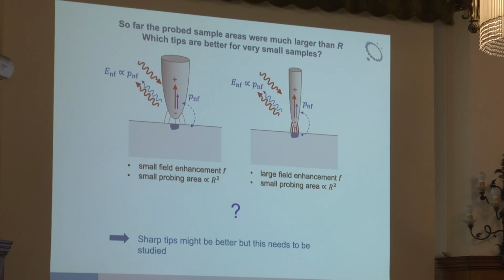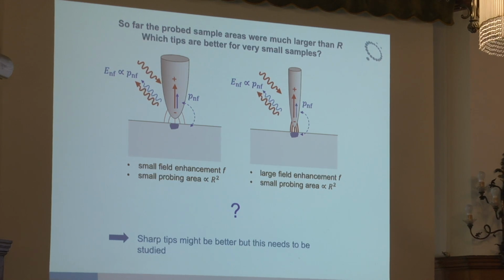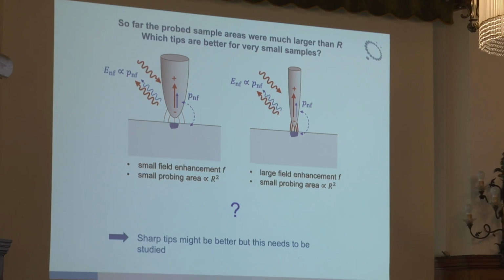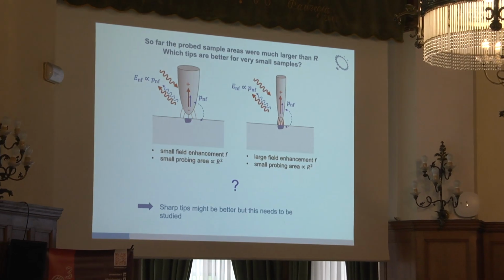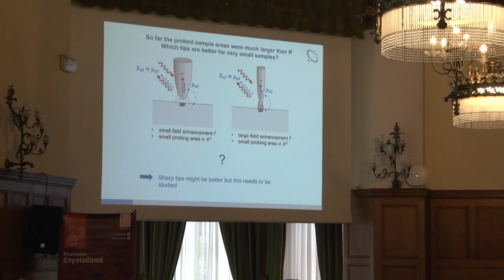So if you have larger areas, and you know that you have a piece of material that is rather large compared to a tip, then choose a tip size that is large. You will get more signal, but be careful because that could also strongly depend on the wavelength range that you use. So terahertz, this is fantastic, and it's amazing. You get orders of magnitude more signal. Okay, I think that was it. Those were the 3 examples.